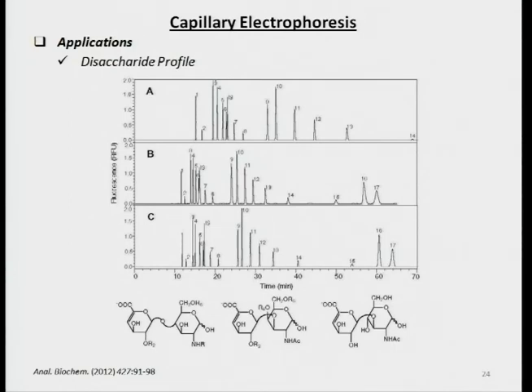So basically they did all of these put together. And the reason why this is important is because when we have cells, the proteoglycans can be anything: chondroitin sulfate, dermatan sulfate, or heparan sulfate, and we simply want to find out what is the composition. So we do a digest, isolate whatever comes out, and then we can measure what these are. And you can see there's almost baseline resolution for essentially all of the species, which is pretty phenomenal.